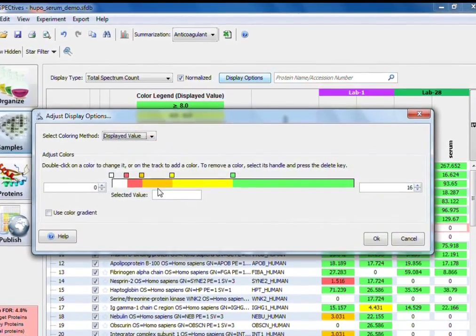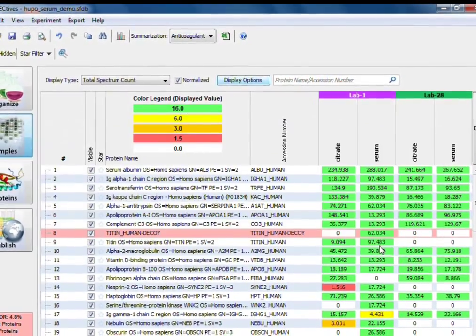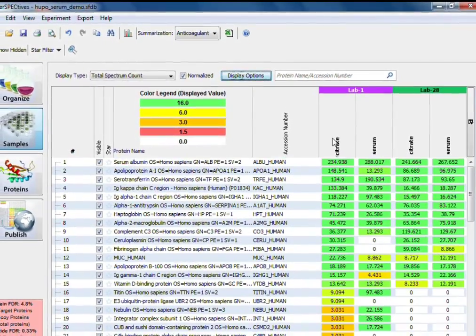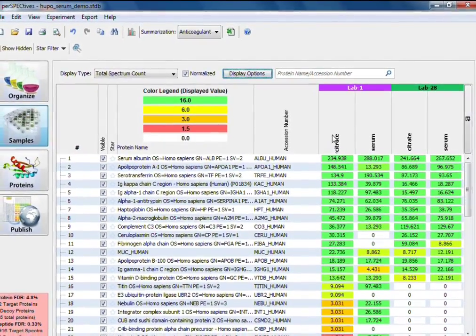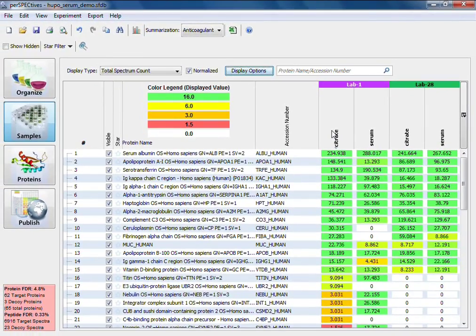Seeing your data with whatever framework is most helpful for your goals is important, and we've designed perspectives to give you the most control in customizing that framework.